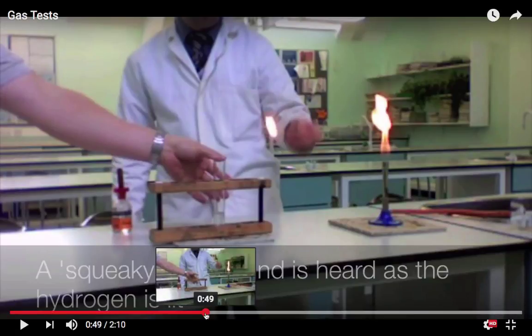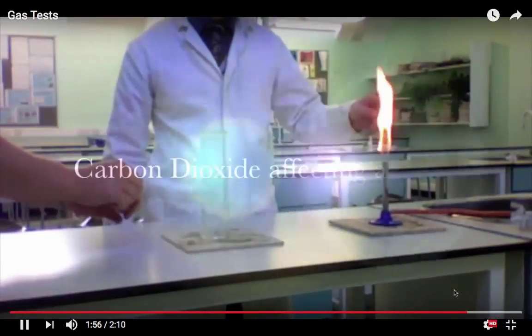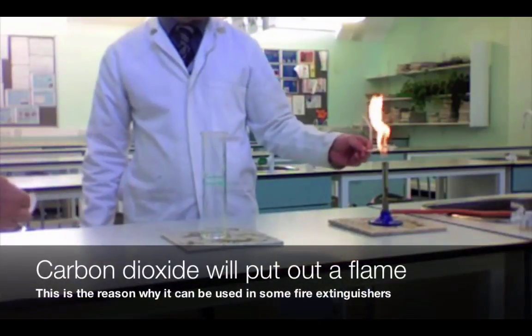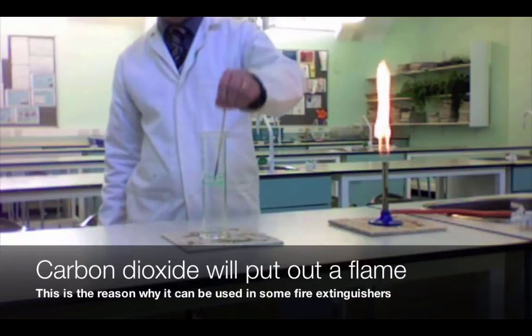Now, the third type of gas that is a possibility is carbon dioxide gas. So let me scroll forward and let's see what happens when it's carbon dioxide. So when he, again, places the flame in the test tube, if it's carbon dioxide, the flame gets completely extinguished. So again, he's going to place it in there one more time, and the flame goes completely out.